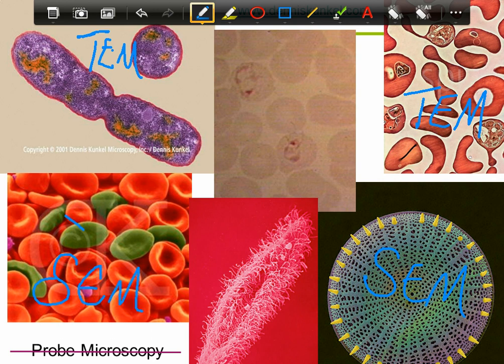Red blood cells. These are sickle cells, by the way, in green. Here's a good example of how adding color can really give you much more information. The computer was told to colorize the cells that were stretched out to a certain diameter more than a regular red blood cell, like sickle cells are, in green, so you can differentiate them easily. This is a scanning EM of a paramecium. This one right here is a regular light bright field type of microscopy for comparison.